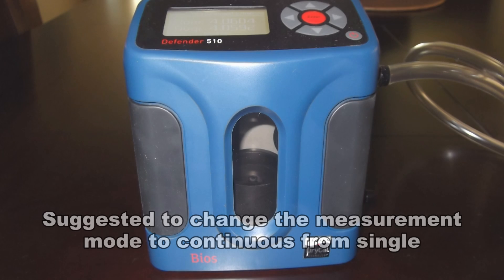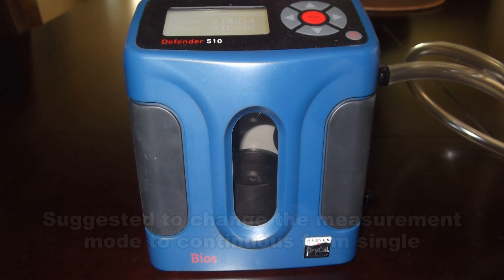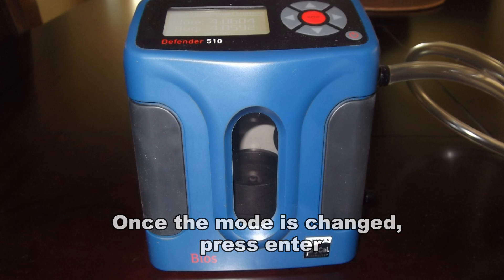On the BIOS Defender models, it is suggested to change the measurement mode to Continuous from Single. Once the mode is changed, press Enter on the BIOS Defender.